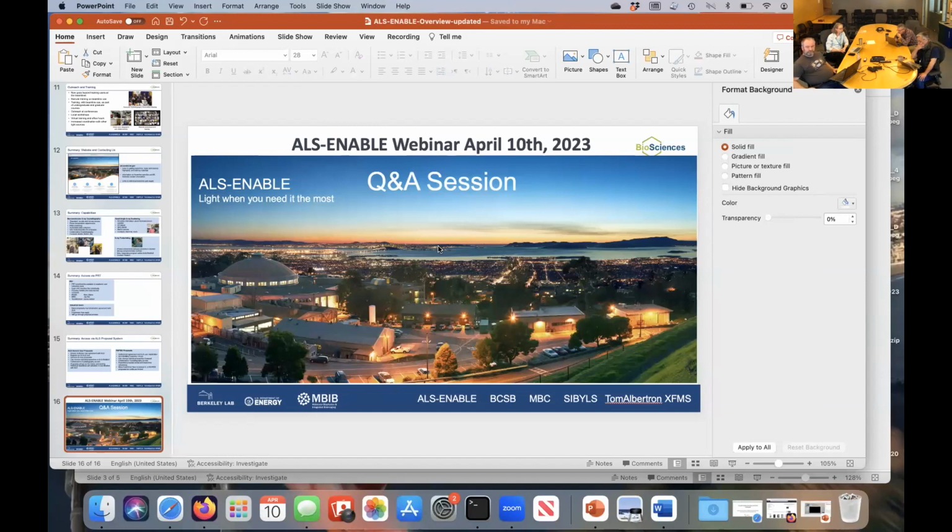We also have a number of beamlines that have kappa or mini kappa capability if your spots like to line up in a specific orientation. That's just terrible for data collection. They're all standing up and they want to rotate in. Getting that off axis can help. But again, that's another one of those things where you tell us what you have and we'll talk about where the best place to put it would be.